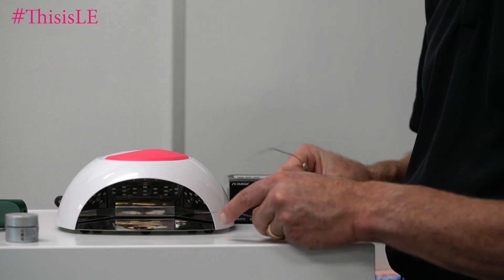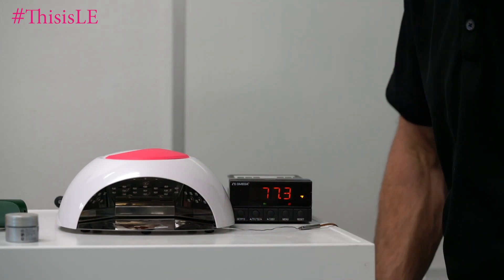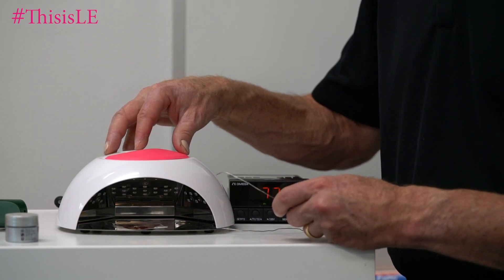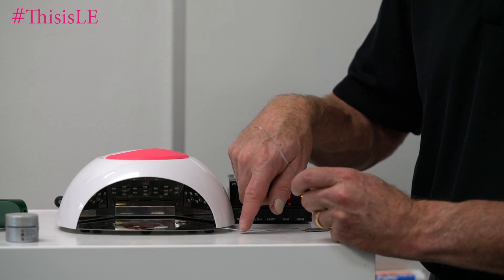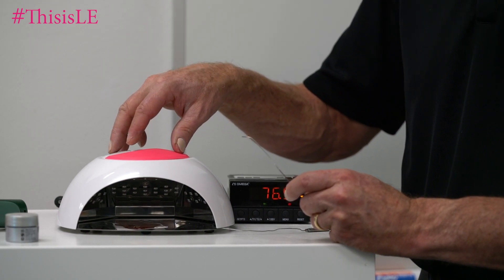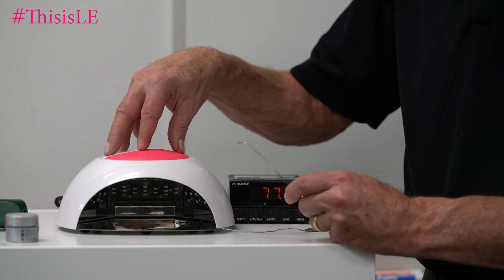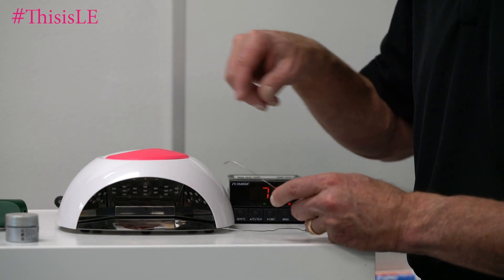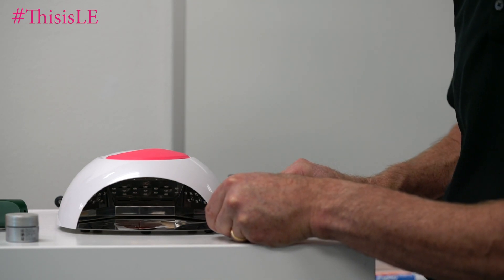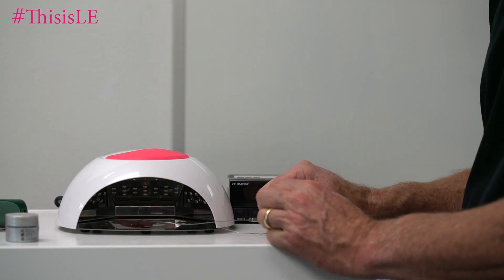I'm going to put this thermocouple inside the curing light — the reason I put it in there in advance is because that will warm up as the curing light warms up. I'll use the second thermocouple as the differential thermocouple. That will give us the difference between the amount of heat being generated by the light, and that amount will be subtracted from the heat being generated by the gel sample itself. So this little piece will go into the gel. This is a much more accurate way to measure the amount of heat being generated.